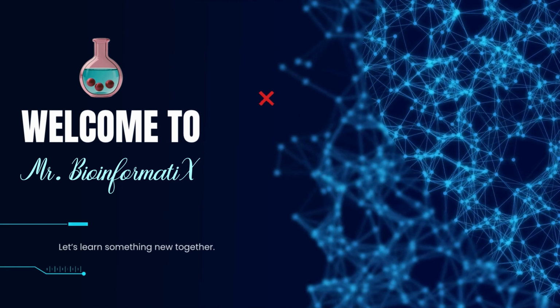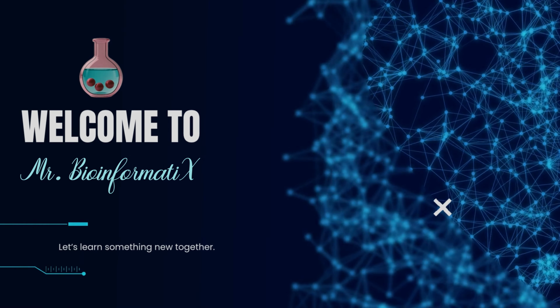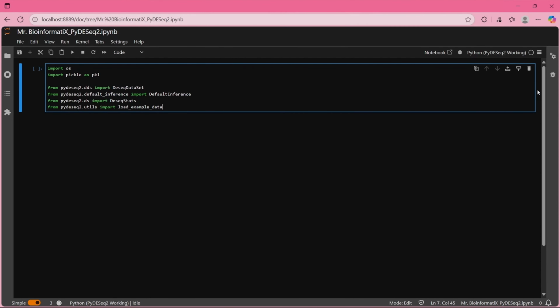You don't need to look for any external dataset because PyDESeq2 provides built-in example data, so you can easily follow along. Without further ado, let's get started. We start by importing our libraries.